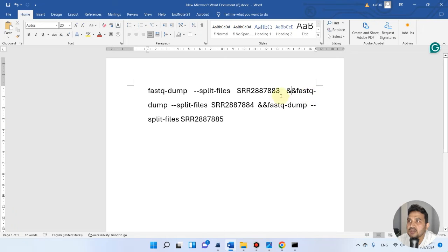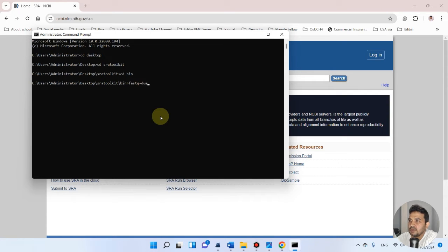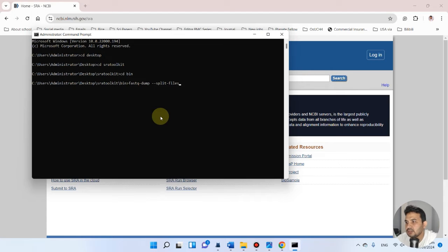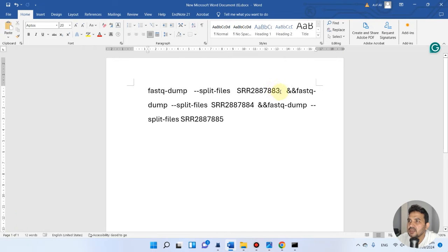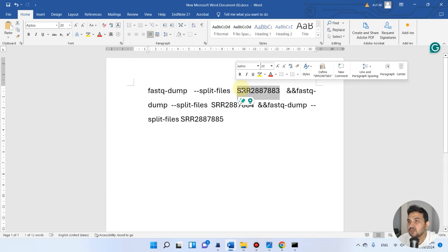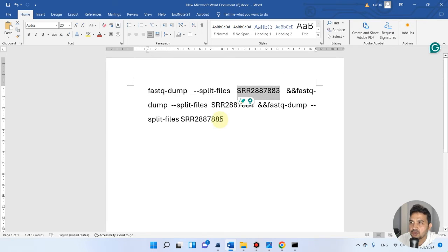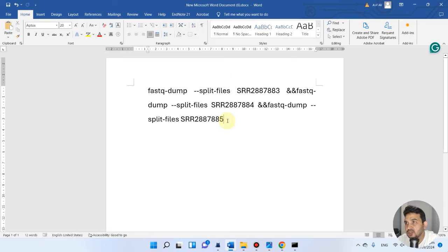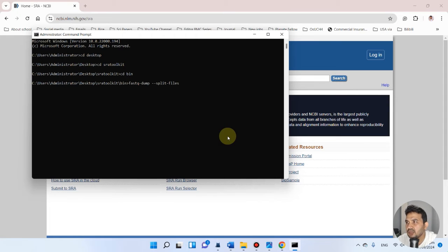So we will write: fastq-dump space minus minus split-files, then we need to enter the SRA accessions. You can enter as many as maybe even up to 100. First you can write your code this way and paste it there. If you see any error that these are too many, you might delete a few.